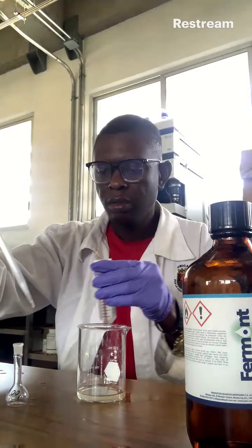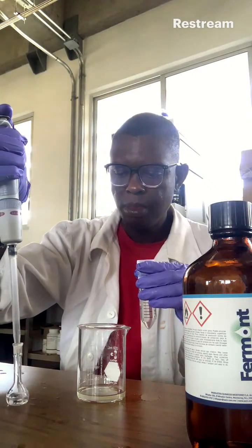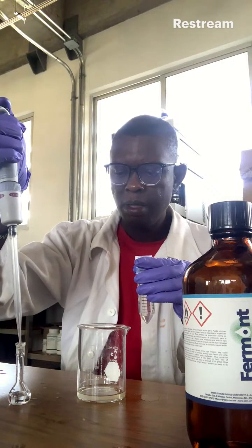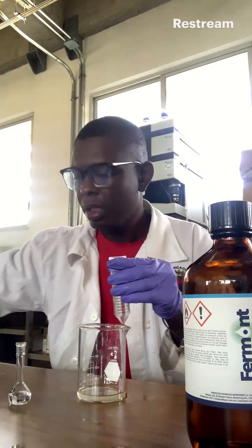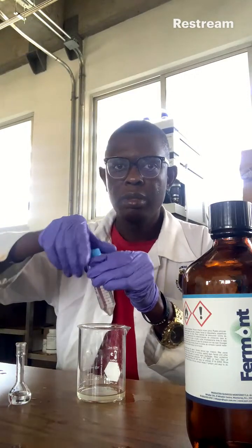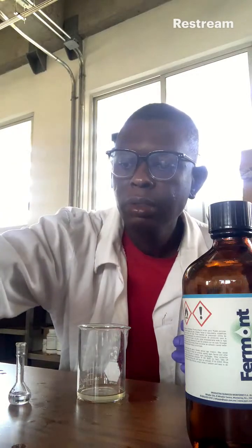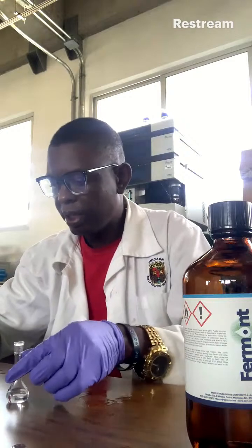Okay. Now I'll put it here. So this is my standard. I have to dilute it. Isopropanol.